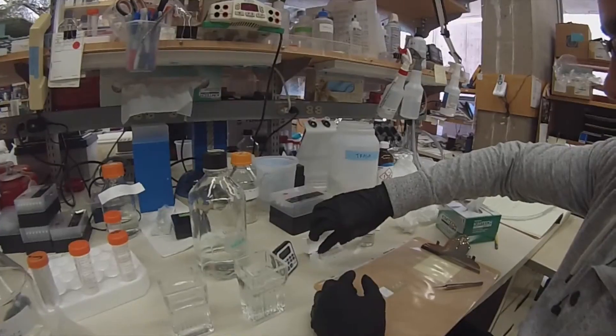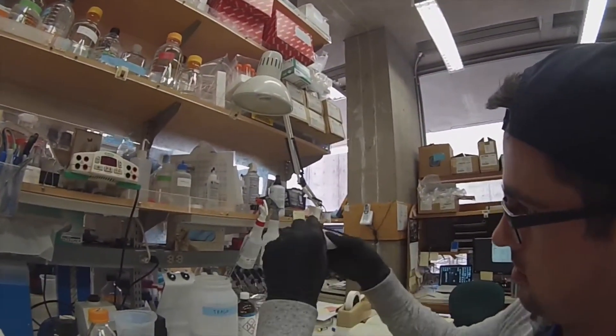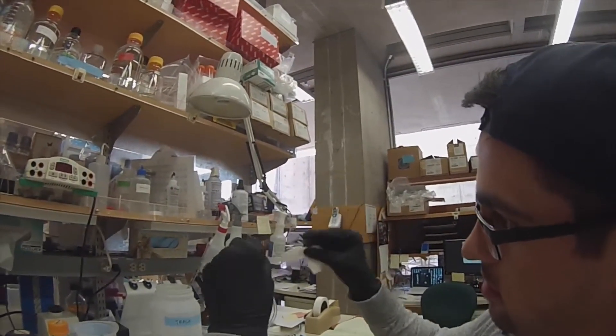From there, you're now taking a coverslip. Make sure that it's completely clean — if not, take a chem wipe and clean it off. Make sure it's nice and clean. You don't want any dirt on this.